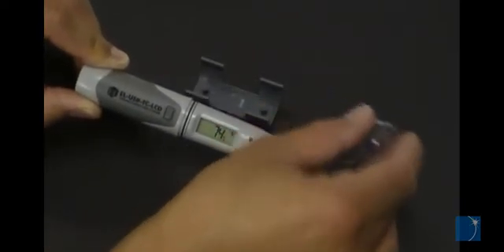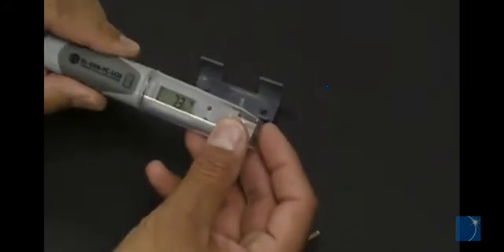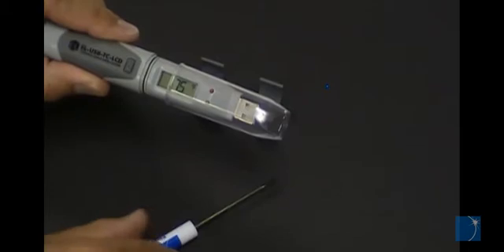ELUSB loggers include a plastic cap to protect the USB connector. A rubber gasket helps keep out dust and moisture.